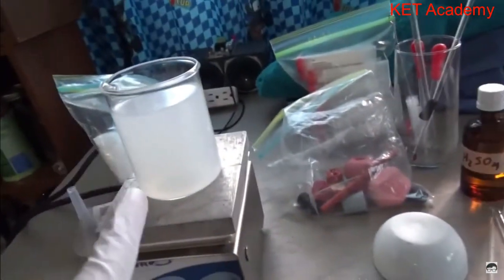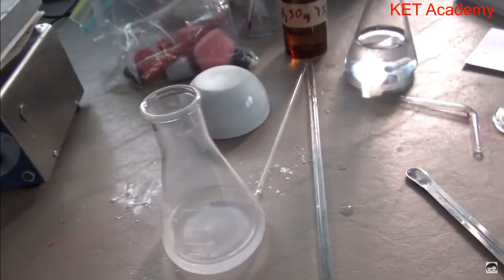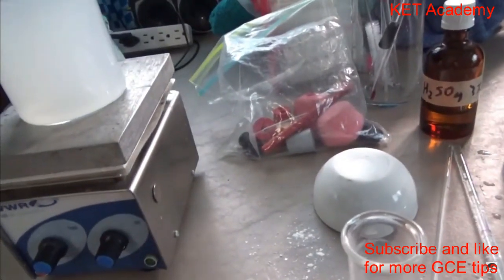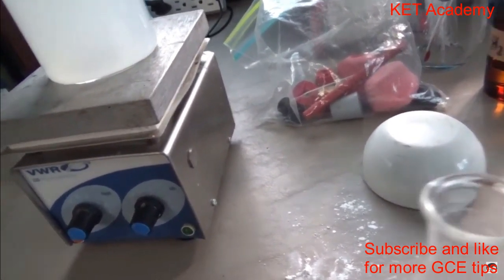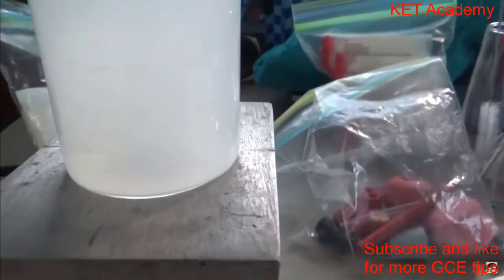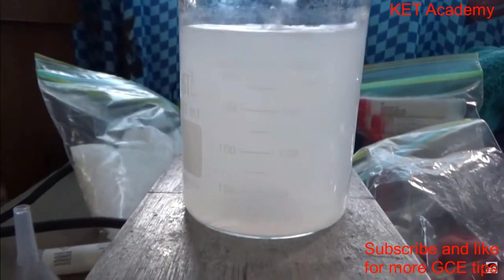Note to self, check solubility charts before starting. Apparently, according to Google at least, the solubility of calcium hydroxide is 1.5 grams per liter at, I believe, 20 degrees centigrade. So that's why it looks like that. It's hardly dissolved. Yeah, don't do what I just did.